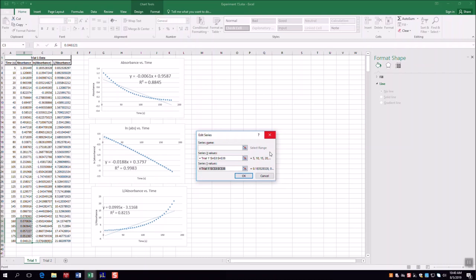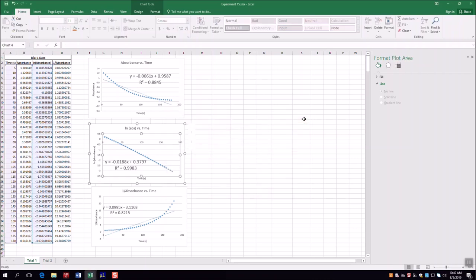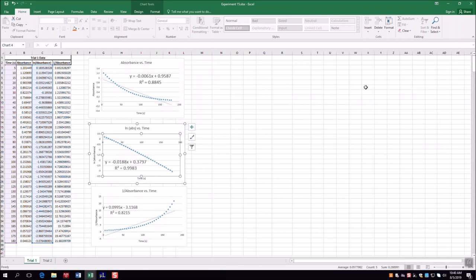In this case, that didn't happen because I started my spectrophotometer reading data very quickly, so all of my data ended up on the graph, but especially in the later trials, that can be hard to do because they react much more quickly as you add increasing amounts of bleach. So the next thing I'm going to go over with you is how to calculate our pseudo rate constants, our K primes, to determine our reaction order with respect to bleach and eventually solve for our rate constant for our reaction.